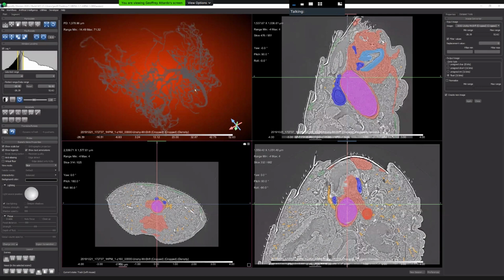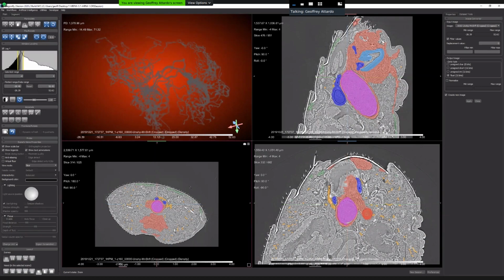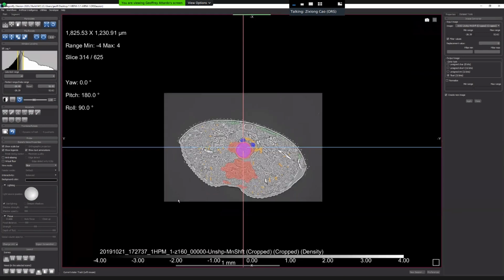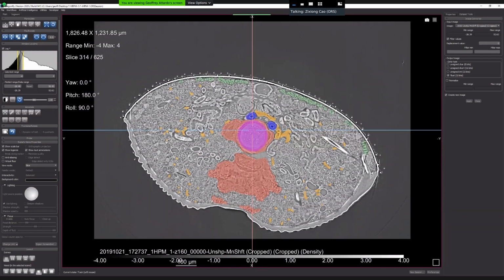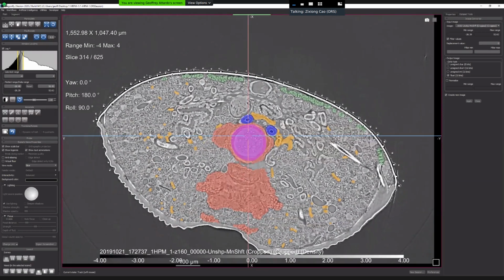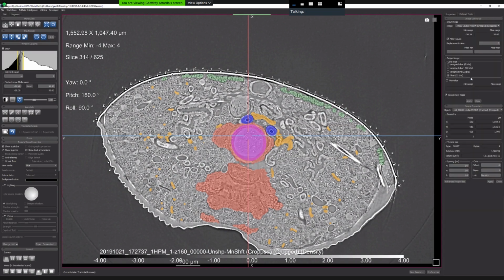Okay. Yeah, this is one of the segmented tissues here. So should I go to the image plane? Yes. You can go to the image plane, and you can right-click the image in the, no, not in the view, in the top right, the list. The right panel, you're back to the, yeah. Right-click your image set and choose the image properties.